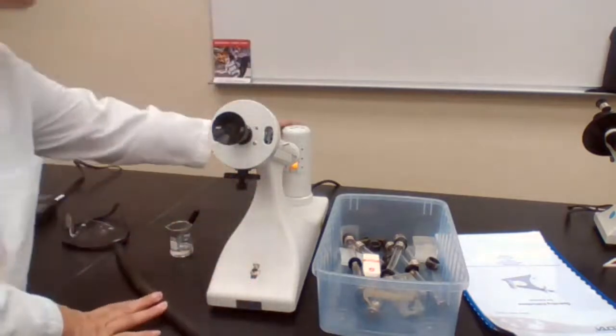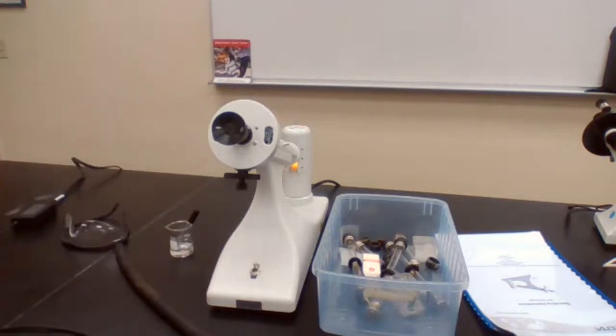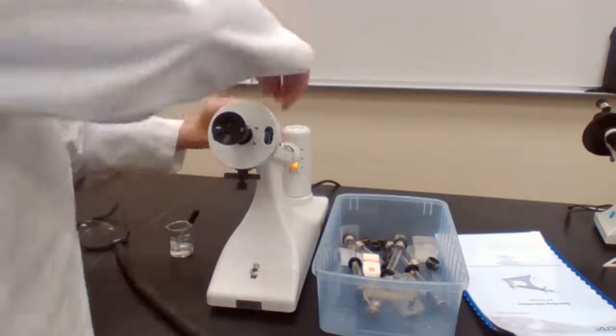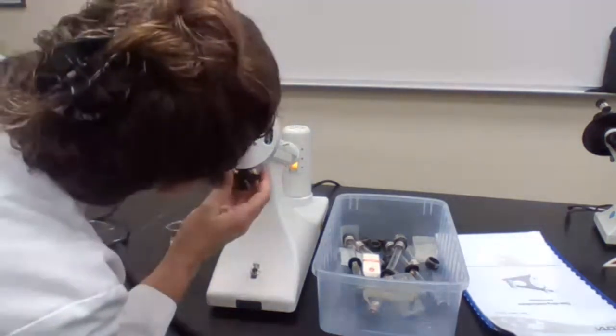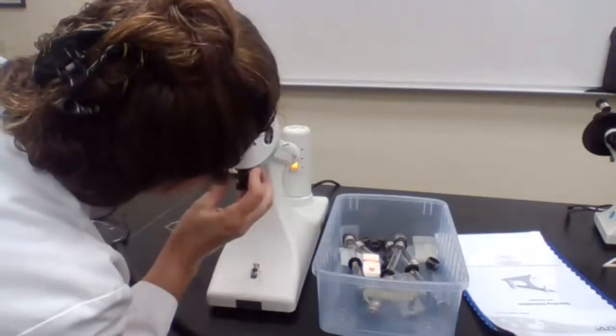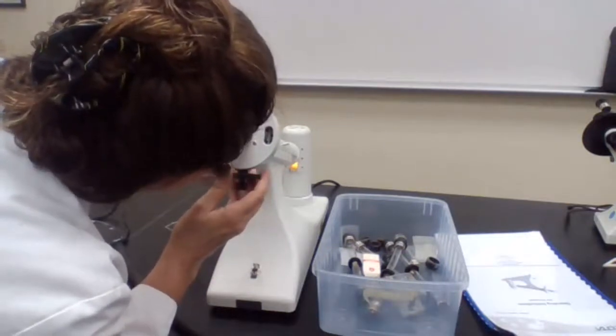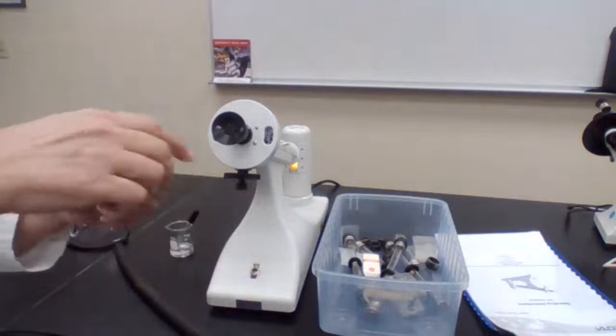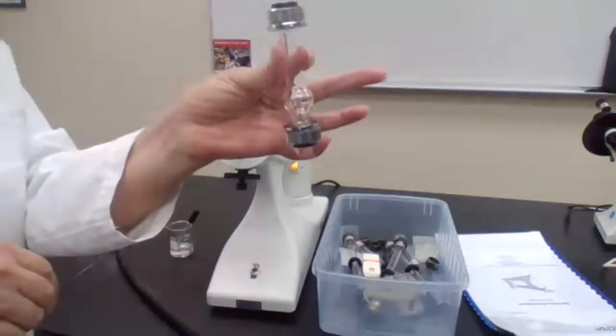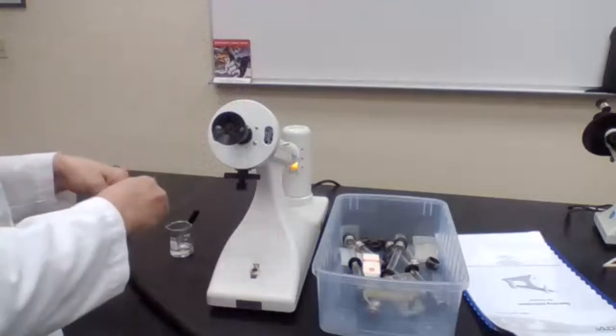Even I cannot see anything yet. Perfect. It's working now. At least you have to trust me. This is the cell that I'm using to place my sample in.